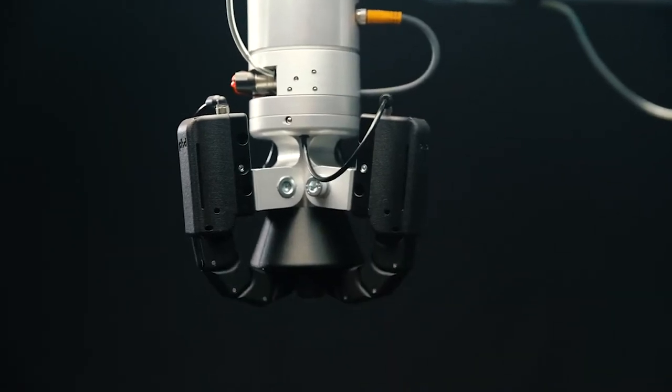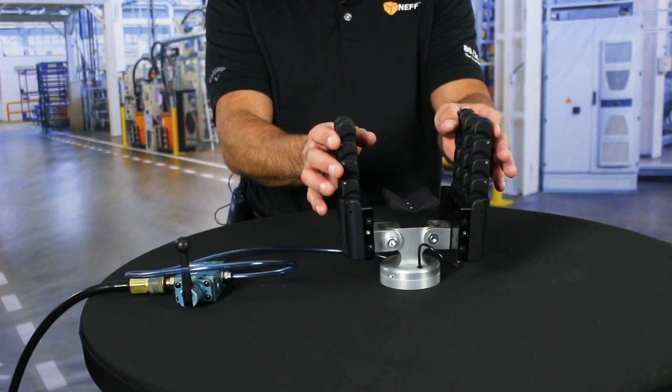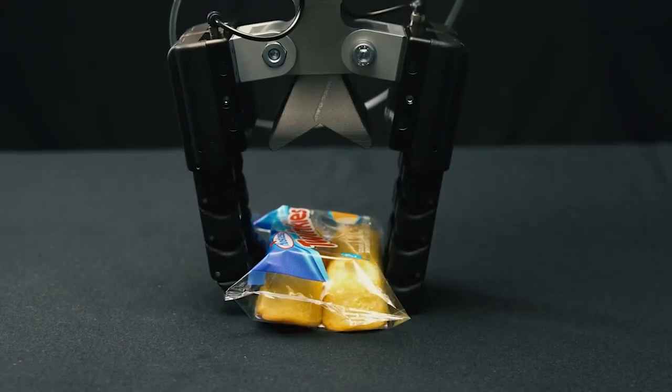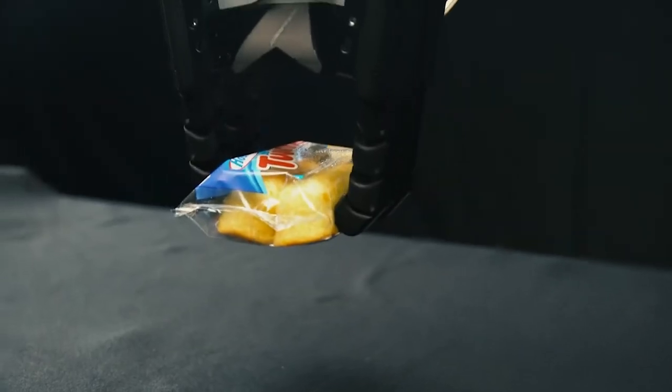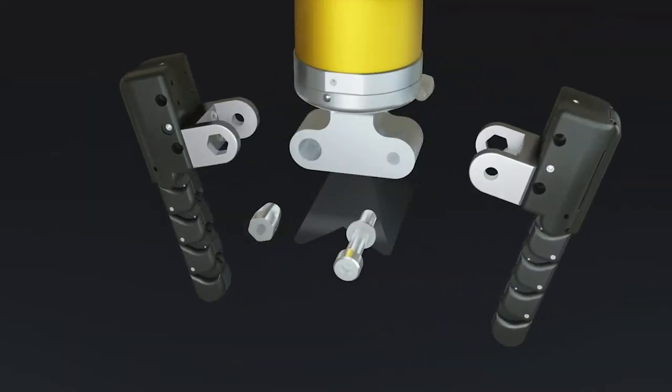When actuated, Flexion's internal tendon system engages multiple joints to encapsulate a part or grip it by the fingertips. The adjustment of the operating pressure allows for a wide range of usable force to provide industrial strength gripping for demanding applications or a delicate soft touch for sensitive product handling. In addition, fingers can be reconfigured by the user to suit multiple purposes as they arise.